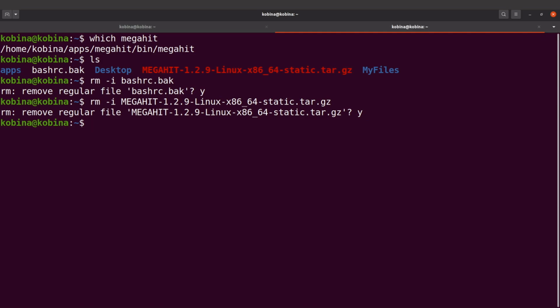So this is how we set up and configure megahit. So now that you are done with this, I also encourage you to watch this tutorial that shows you how to perform assembly using megahit.